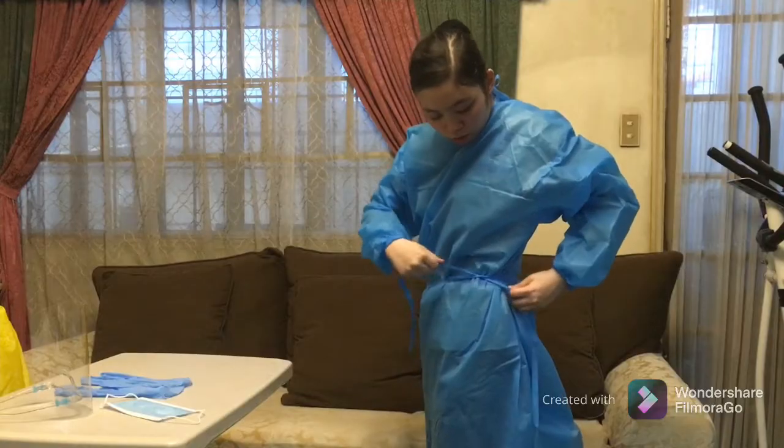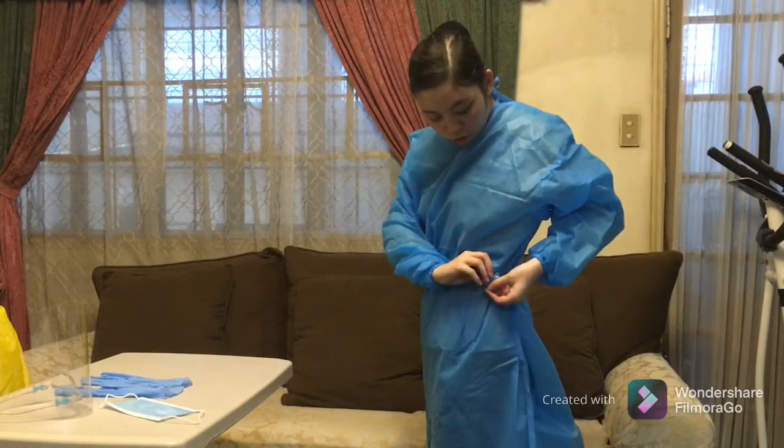Overlap the gown at the back as much as possible and fasten the waist ties.